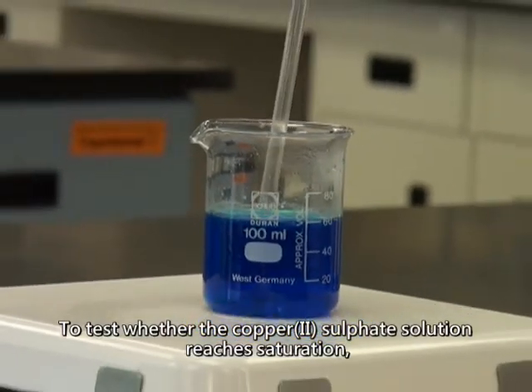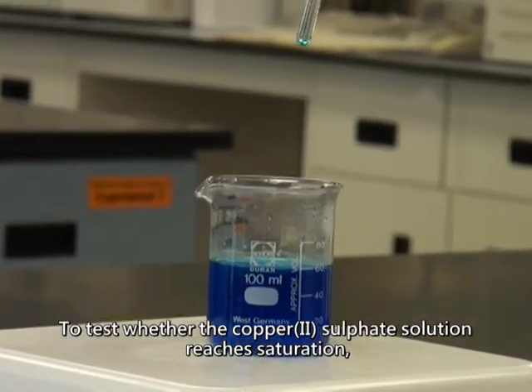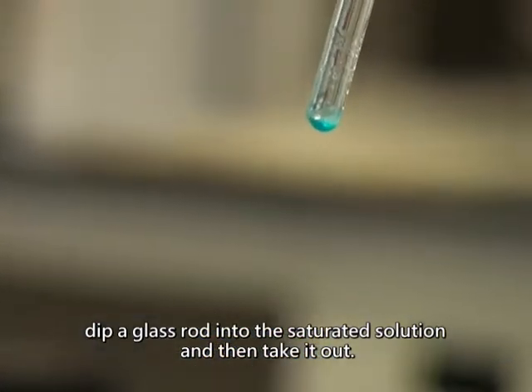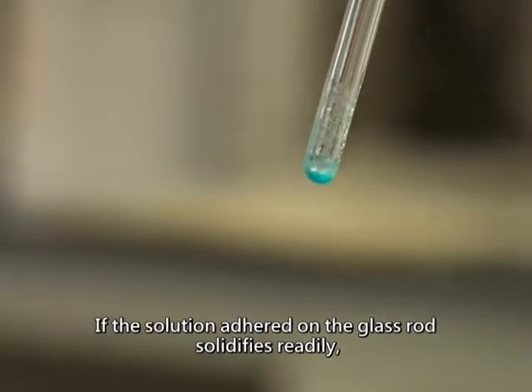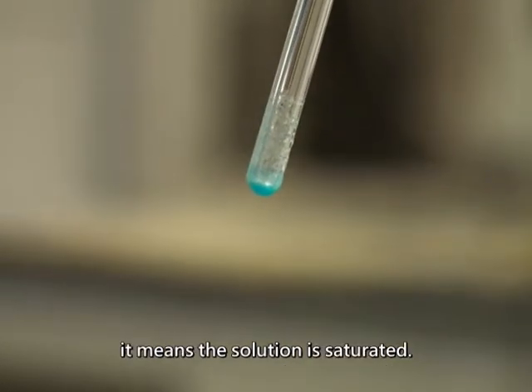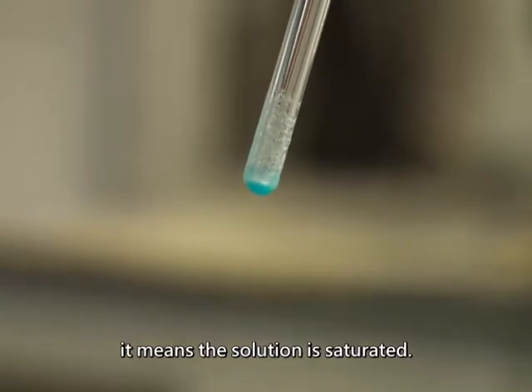To test whether the copper 2 sulfate solution reaches saturation, dip a glass rod into the saturated solution and then take it out. If the solution adhered on the glass rod solidifies readily, it means the solution is saturated.